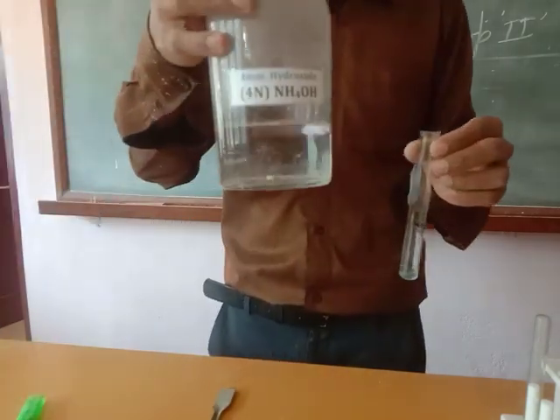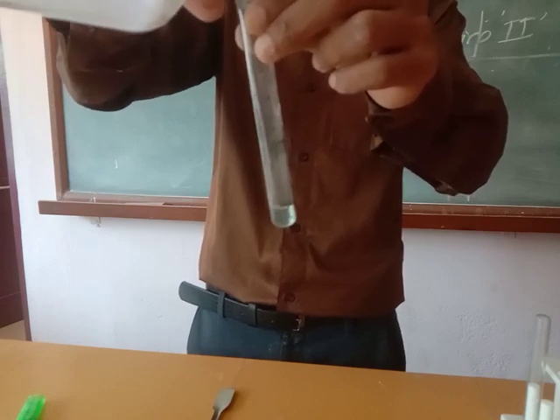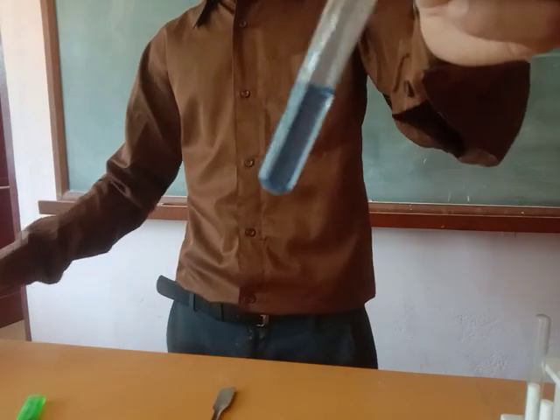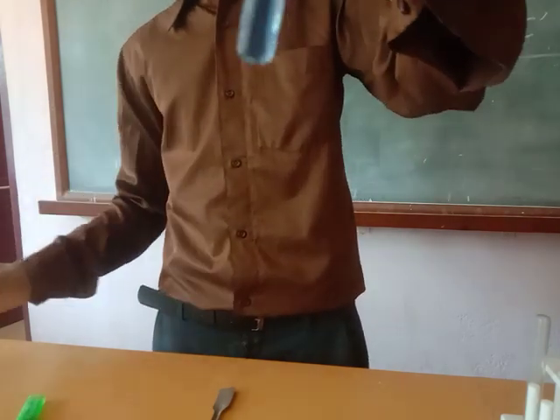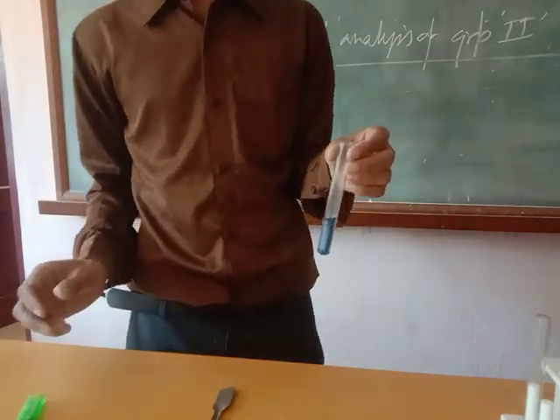This is ammonium hydroxide. After adding ammonium hydroxide, if you observe deep blue coloration, then it indicates copper ion.